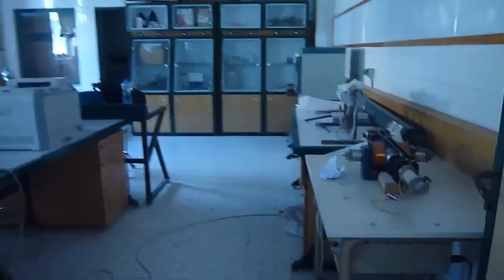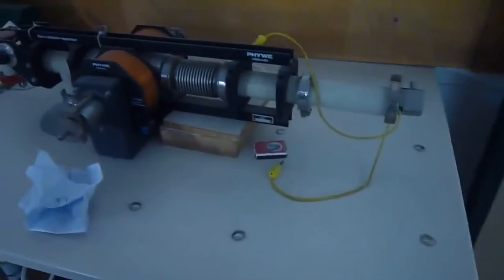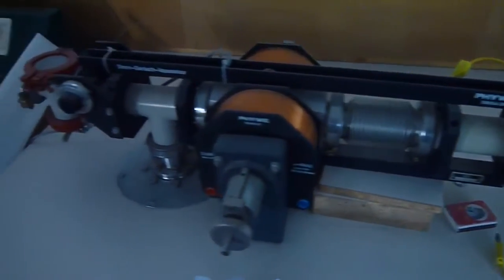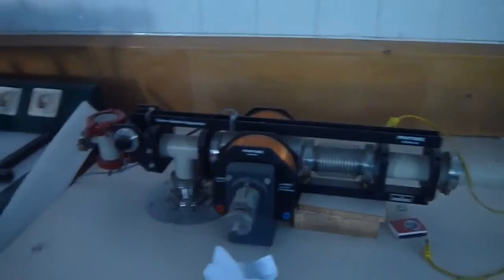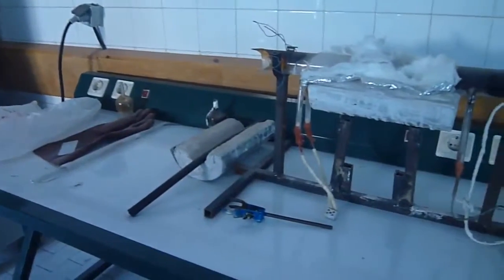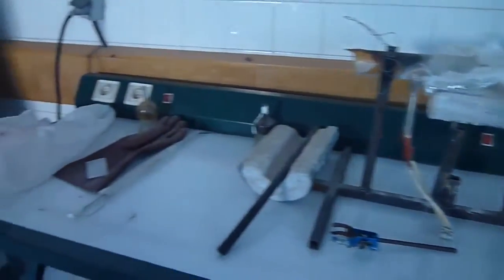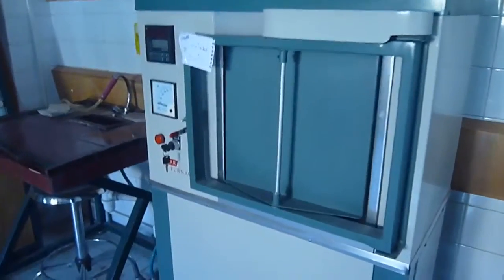This is one of the furnaces in our laboratory which we use for the annealing process. Annealing in metallurgy and material science is a heat treatment that alters the physical and sometimes chemical properties of a material to increase its ductility and reduce its hardness, making it more workable. It involves heating a material to above its recrystallization temperature, maintaining a suitable temperature, and then cooling.